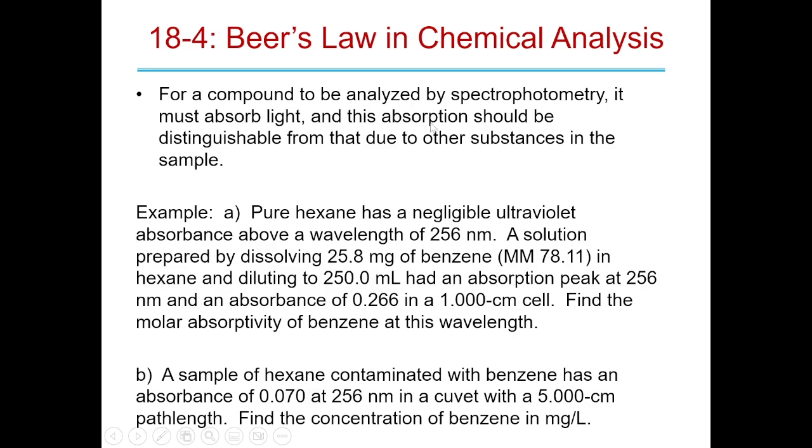Well, this peak's rise and fall is not actually just due to the concentration, right? It's due to this other peak next to it moving. And that's why you always want to take your maximum absorption peaks when you do things like visible light spectroscopy like we did, and are trying to make a Beer's Law curve, because then you don't have other stuff adding much to it. You get the least addition to it. Does that make sense?